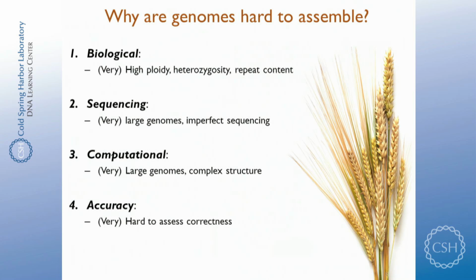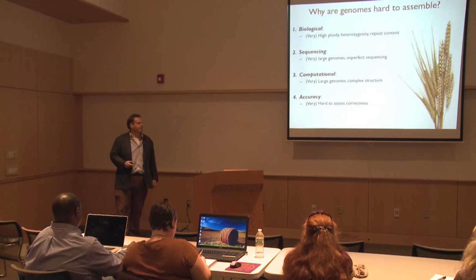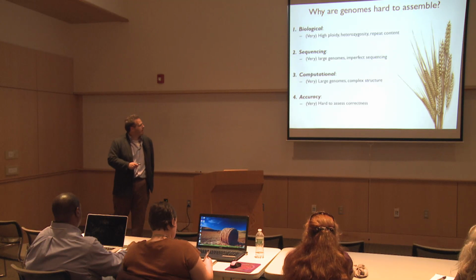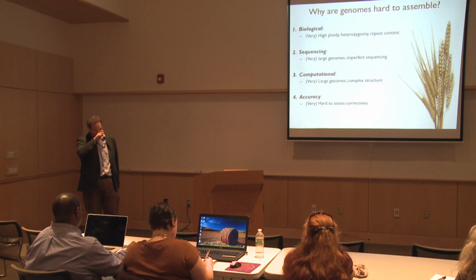Fortunately, Illumina technology especially is rapidly decreasing in cost, such that it's becoming more and more affordable to go for these larger genomes. The instruments make mistakes along the way, though, so we have to be careful about sequencing errors and lack of coverage because of weird motifs or other systematic errors in the data. I've talked a little bit about the computational challenges along the way.